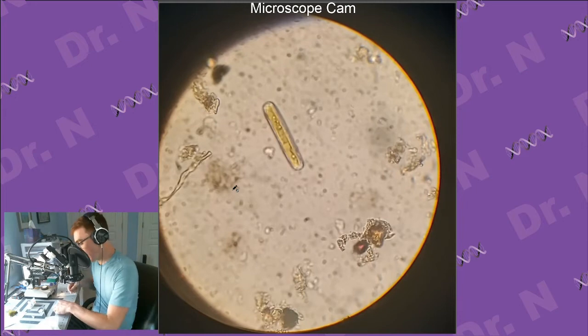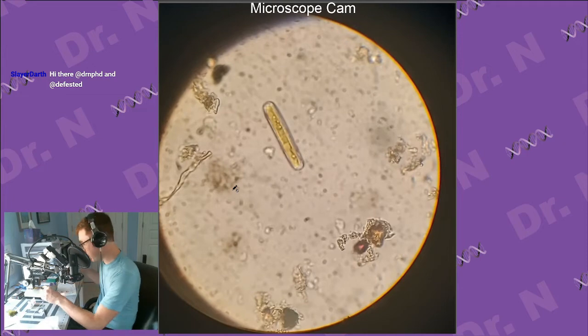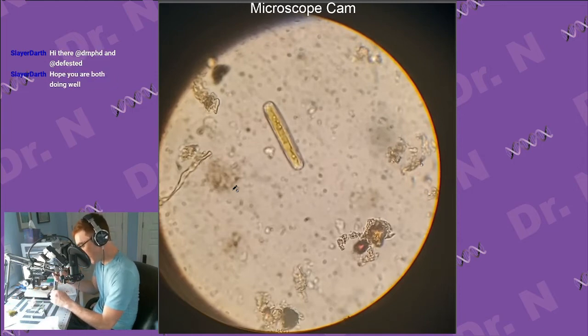So you just kind of roughly swab the inside of your cheek. People do this in high school all the time. So hopefully I was gentle enough not to have destroyed all of the cells. So they are on my little glass plate. And now I will drop just a little bit of my blue stain on them.